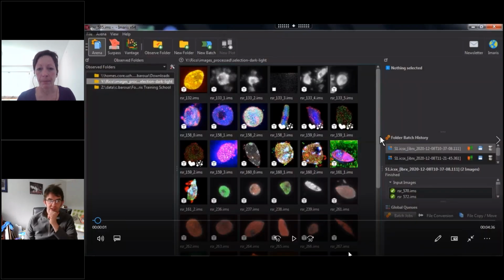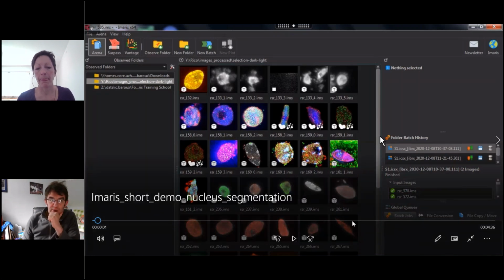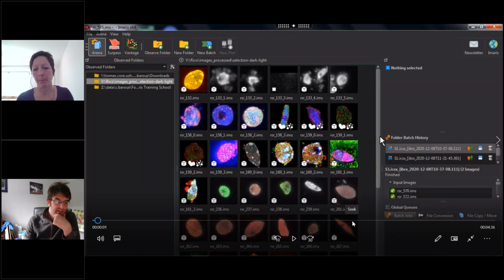Celia, let me ask, can I come in and ask a question just at this stage? So Christophe has asked, he said he could not get the exact difference between body-centric and domain-based organization. Can you explain the difference in a bit more detail? So that might be relevant to what I thought.